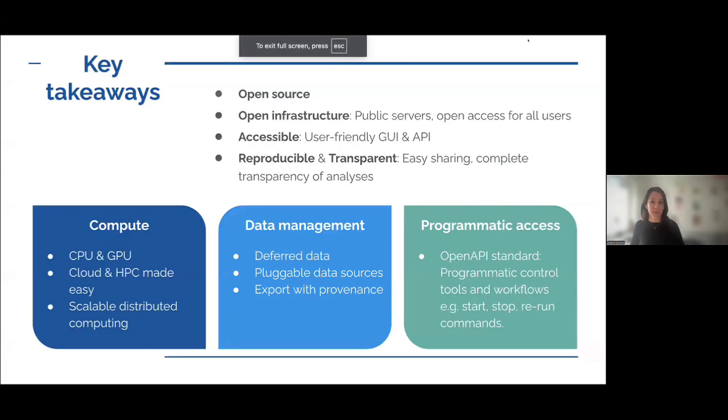Okay, so a summary of everything that you've seen from the three of them. That's Anne, Leonid, and Ricardo. I think you saw from different angles how you can do your image analysis there. And I wanted to summarize everything in one slide as different features that are available for you to use. So the first one, this is an open source platform. That means that you can take the code and reuse it, you can take the platform and install it yourself in your institute, do as you like on your local computer. You can also contribute to it if there is something that you would want to improve there.